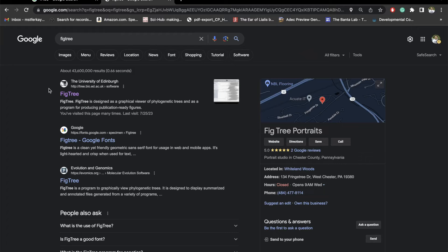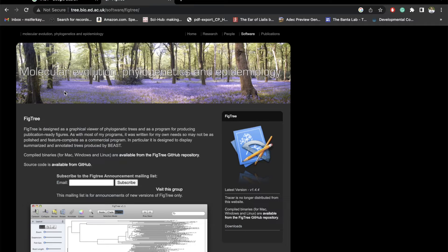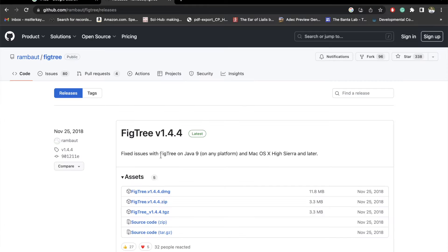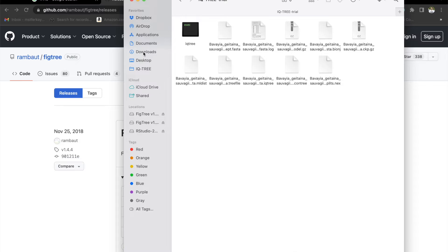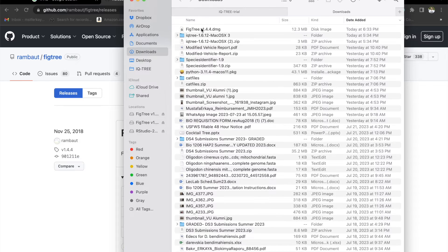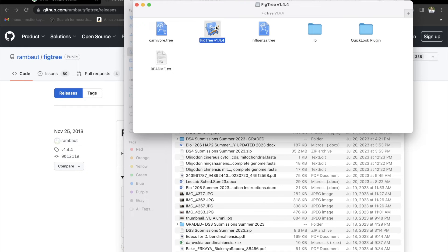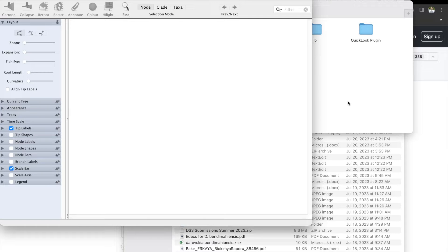Let's go and find FigTree on Google. Click on this link and download the DMG file. Let's go to the Downloads folder. This is the file that you should open. Click on Open, and it should open the application. FigTree is right here.